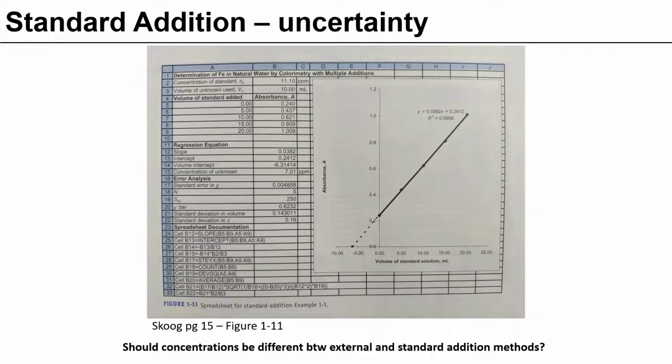Now, with more complex samples, we're giving you 4 phthalates dissolved in dichloromethane. If these were a more complex matrix, like blood or urine or biological tissue, you might see differences between external calibration and standard addition because there might be some matrix effects that the external calibration curve doesn't account for, where the standard addition curve will account for that.